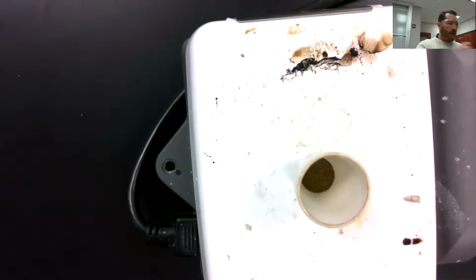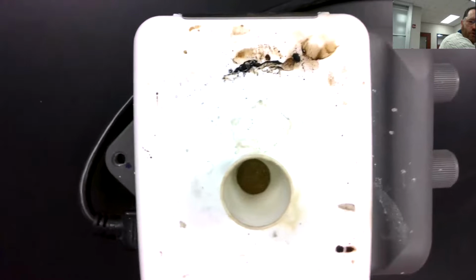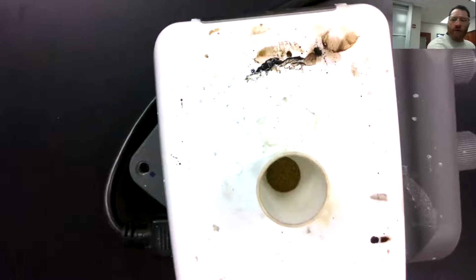All right, back again. Probably didn't feel like 10 minutes to you guys. Probably feels like I just went off the air, but through the magic of television, we just waited about 10 minutes. So let's take a look at what it's doing. You can see it started off with that whitish color. Now it's a very dark brown color, a good indication that we have evaporated all the water off. We call it driven all the water off.